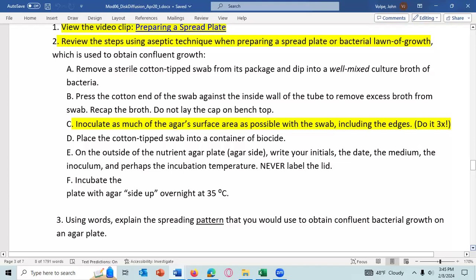And then you should incubate the plate no longer than 15 minutes after you put the paper discs containing the antibiotics on the plate. And what you do is you turn the plate, get the lid on, turn the plate upside down, and then grow it in the incubator for the appropriate time. It's about 16 hours. I think it's 16 to 18 hours at 35 degrees temperature.